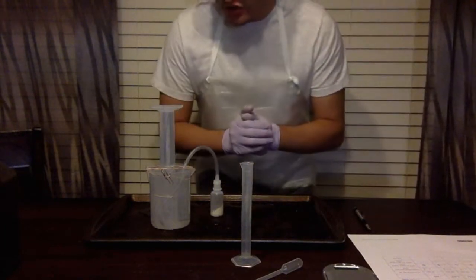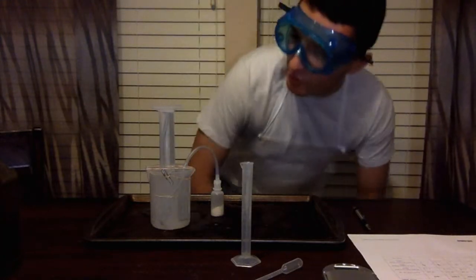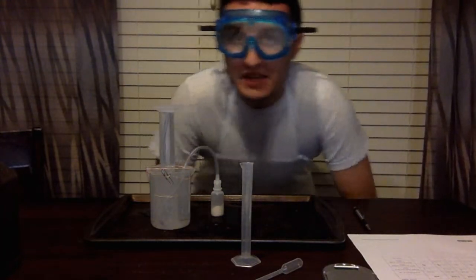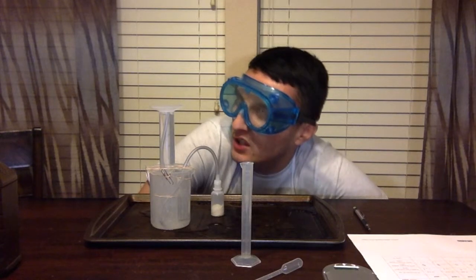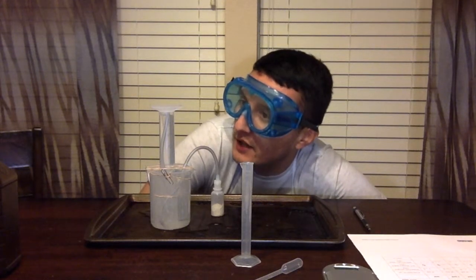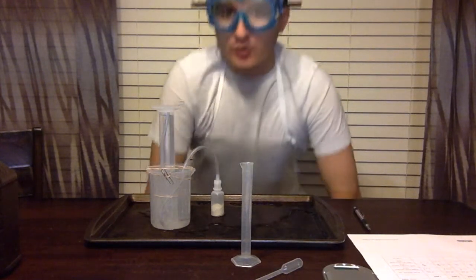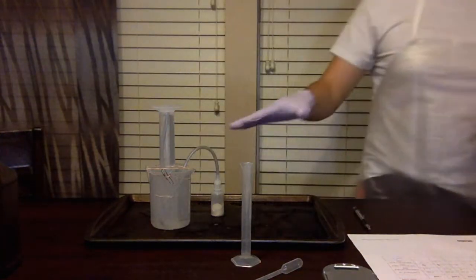Now, since we are using the yeast to speed the reaction up, this reaction should be completed in about a minute, so it doesn't take long. And already I'm starting to see some gas pushing the water downward. It looks like we've accumulated almost 2 milliliters of O2 in the graduated cylinder, and the reaction is still going. So we're going to let that sit there for a couple of seconds, and then we'll be back.